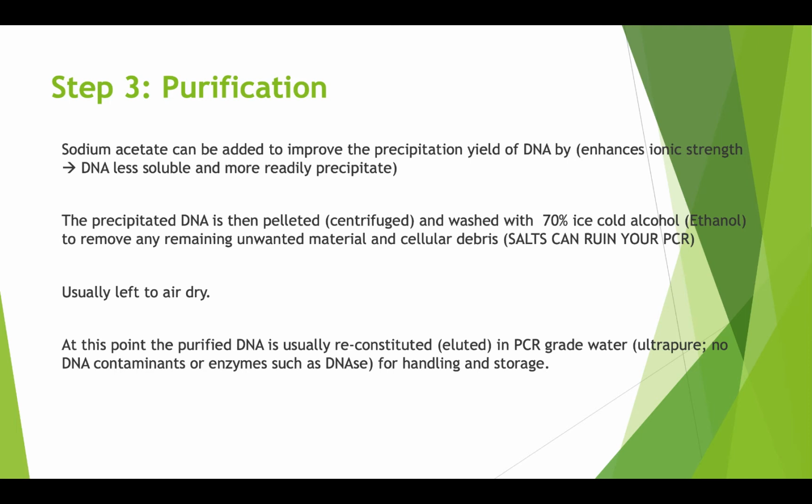Now you have pulled out the DNA, you washed it, and then this is what you need to do. You are trying to wash the DNA and purify it from two things: the remainders of cellular debris still stuck to the DNA, and the salts, because salts can ruin your PCR.